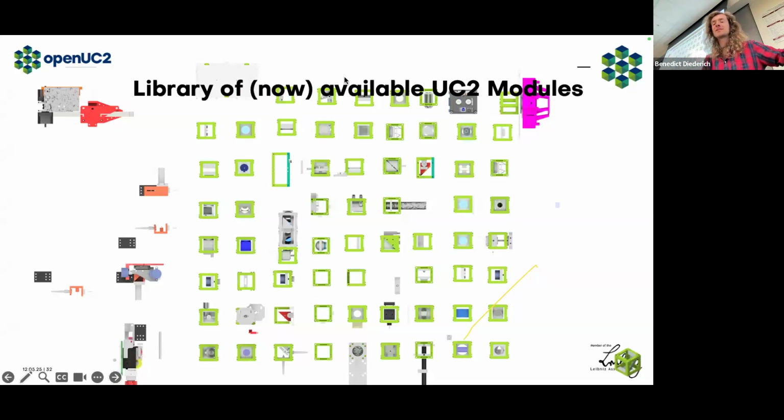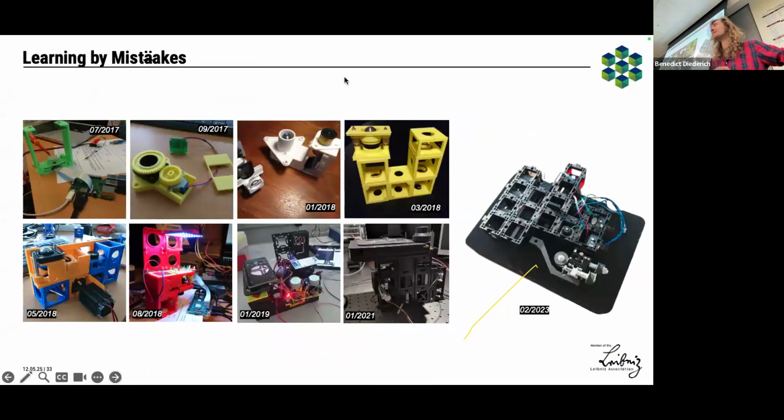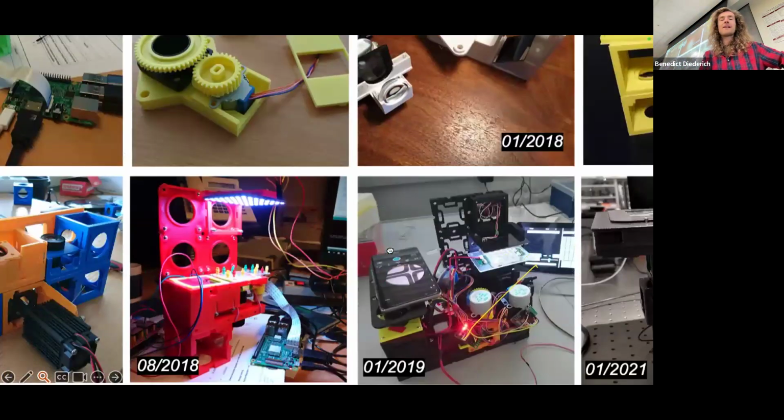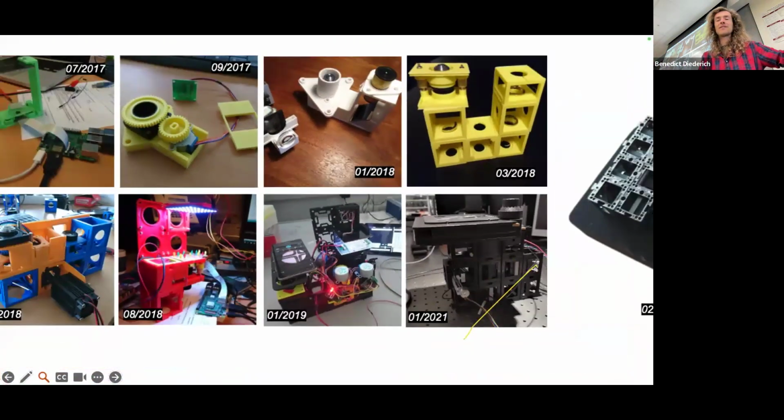What I'm trying to show is the story behind it, because it's been out for, I think, seven years now. It all started with someone approaching us to say, hey, I need a little microscope which can be used for observing macrophages in an incubator. Macrophages are part of our immune system. Then we built this little thing here. It was basically a Raspberry Pi camera with a retro-mounted lens. But then they wanted fluorescence, they wanted autofocusing, and then it kind of grew. And just for today, I've put together some more images.